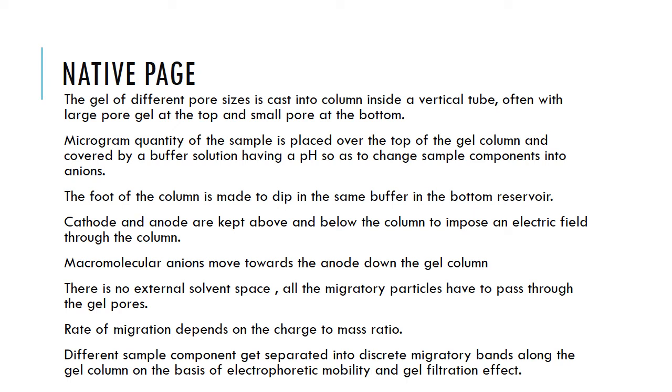I've already mentioned this. The second point is that there is no external solvent space, so all the migratory particles have to pass through the gel pores. Here is the difference.